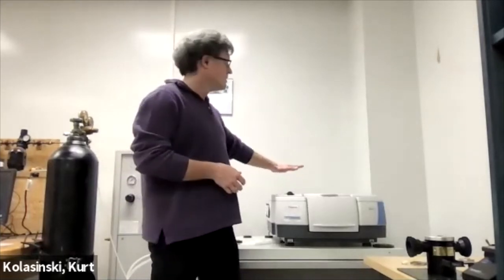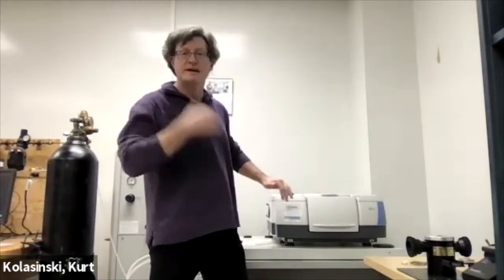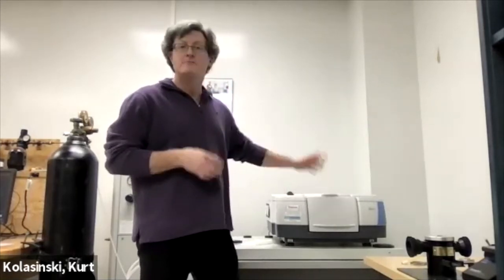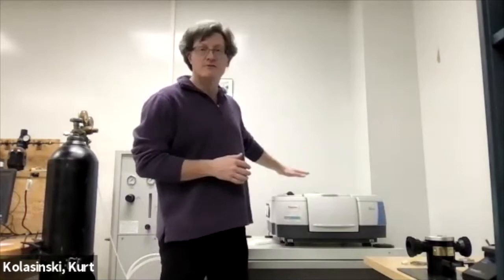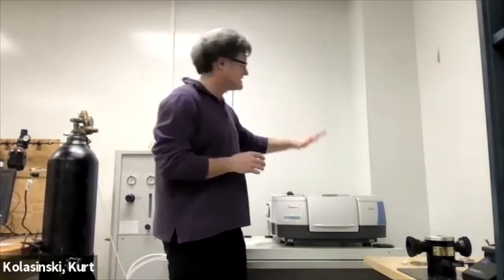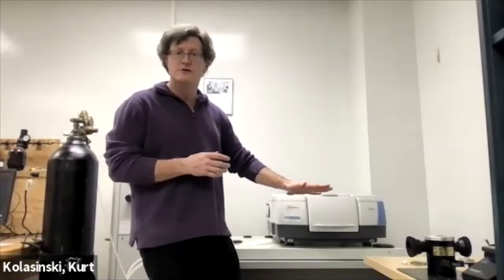All right, so we don't need to purge the whole instrument here, although I did for the high resolution. But we always need to take a reference, right? The very best data is going to be with a reference, where everything is purged, and you have the cell in here. The cell itself is purged first, right?